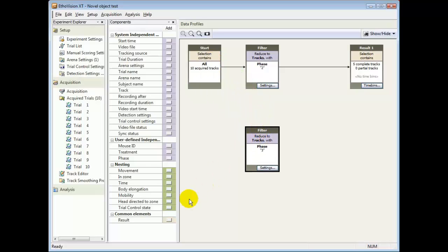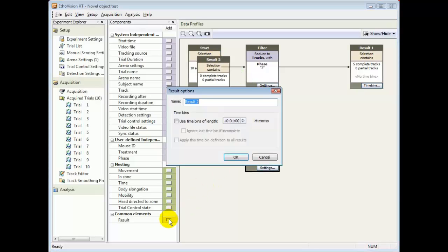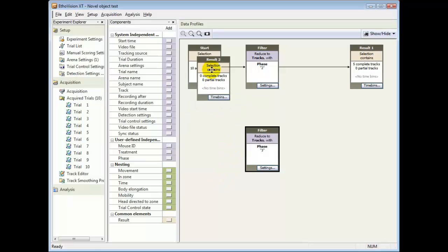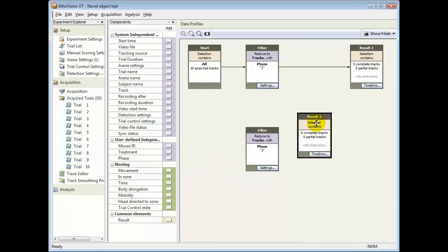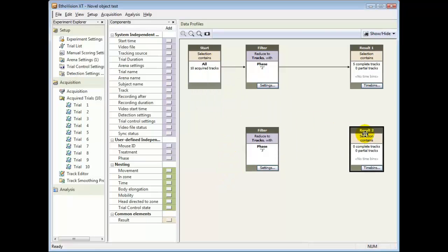I collect these data in separate results containers. This means that I'll be able to compare phase 2 trials with phase 3 trials.